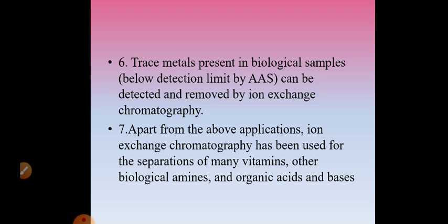In certain biological samples, trace metals are present below the detection level of AAS, that is, atomic absorption spectrophotometry cannot detect the metal because they are present below the detection limit. These can be detected and removed by ion exchange chromatography.